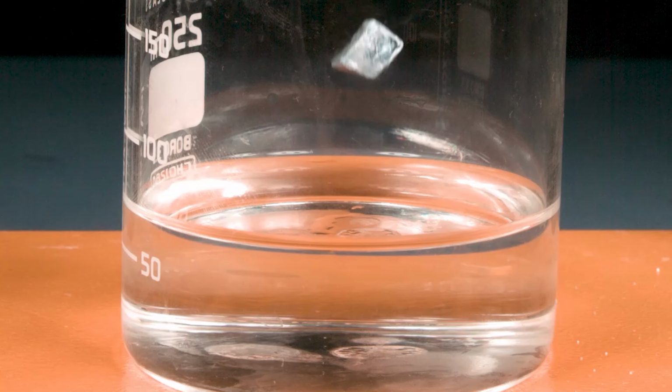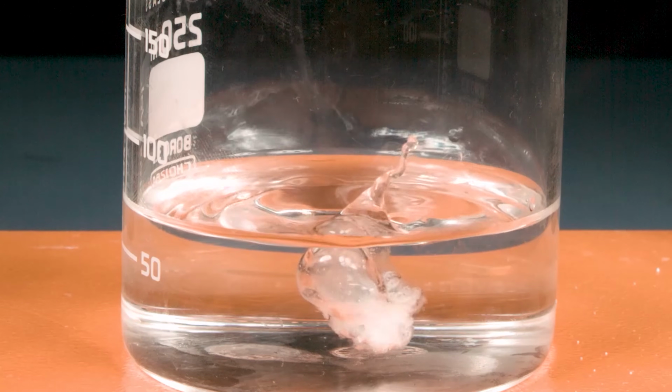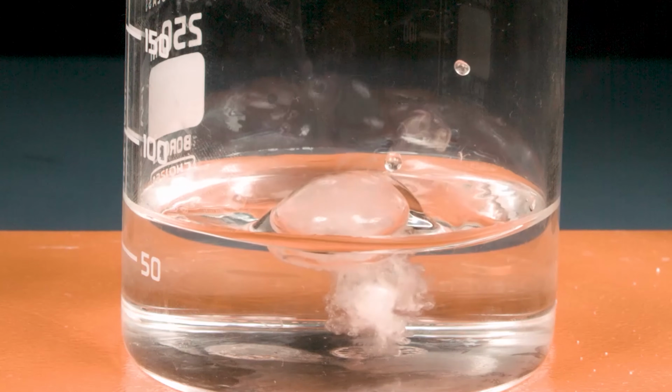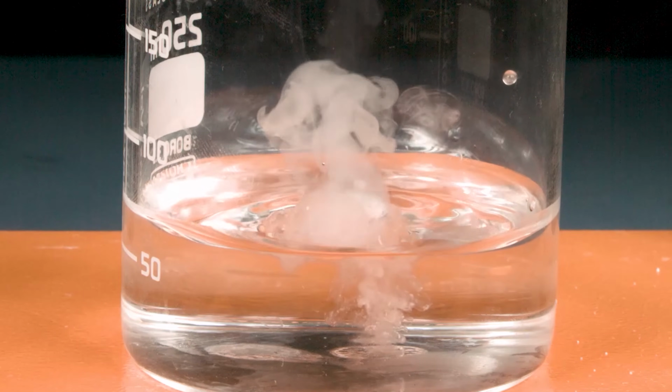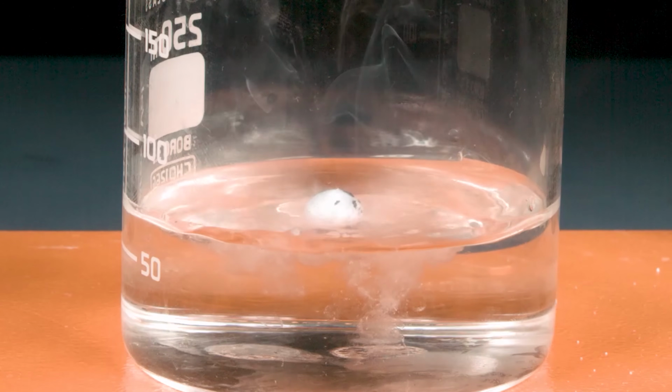Here's potassium dropped straight into a beaker. Something cool happened that I did not notice until editing the video. The hydrogen is formed, there's a bubble. Look at that bubble. Look at that mushroom cloud, and then boom, it ignites with a pale purplish glow flame.